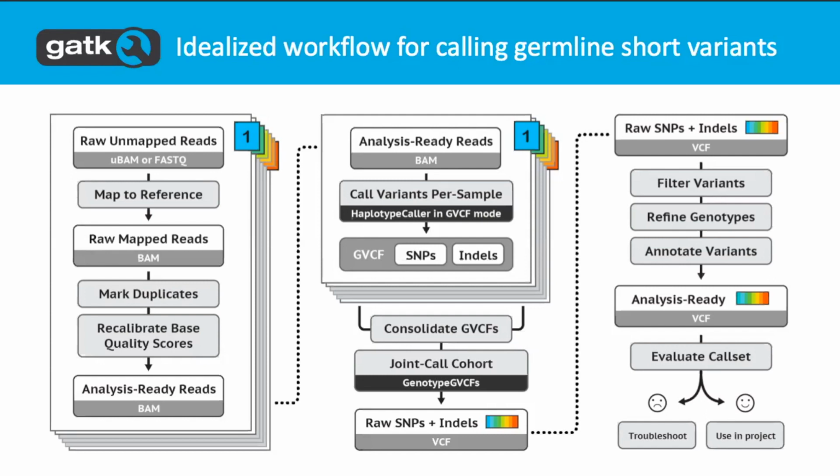The CNN approach is kind of similar in the sense that we're also doing HaplotypeCaller first. We're just doing it explicitly as a separate step, and then applying the CNN. I'm not the right person to talk about the comparison between how the algorithms are implemented, but it is similar concepts that are used. But our CNN works better. I have to say that.